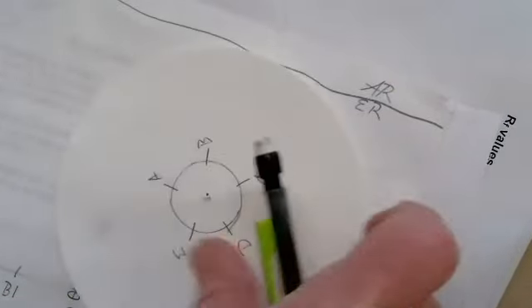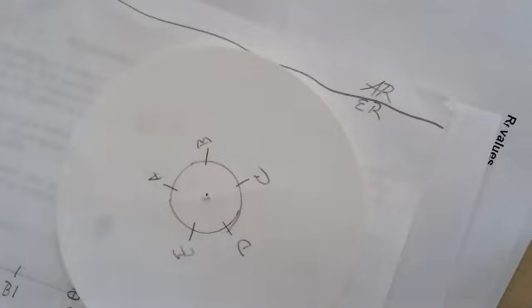Thank you. 1.5 centimeters. The sodium chloride solution is already in your beakers. We are observing and measuring. And if we have time to calculate, if we don't, we'll finish that tomorrow. But there will definitely be time when these are developing, and then the markers and pens are developing, and we're just kind of waiting.